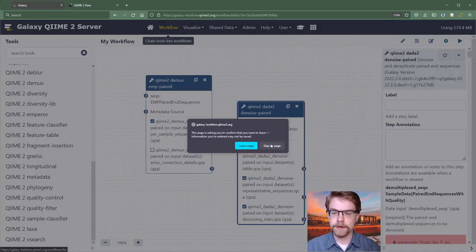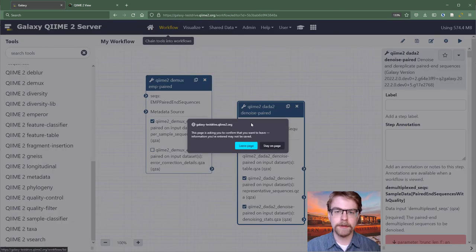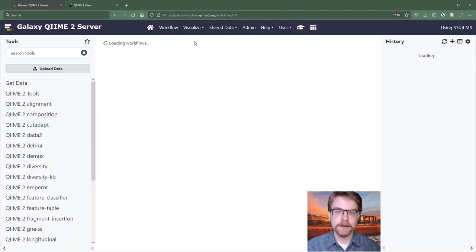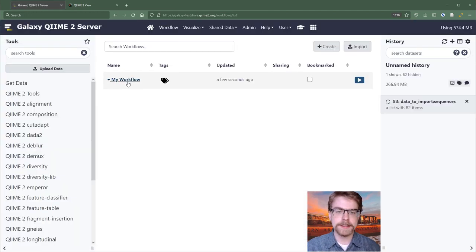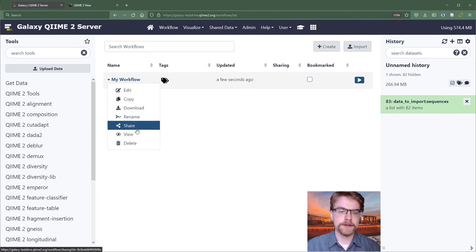If we go back to workflows, we can see it's right here. And you could share those.